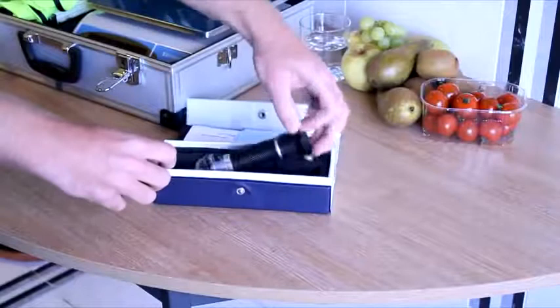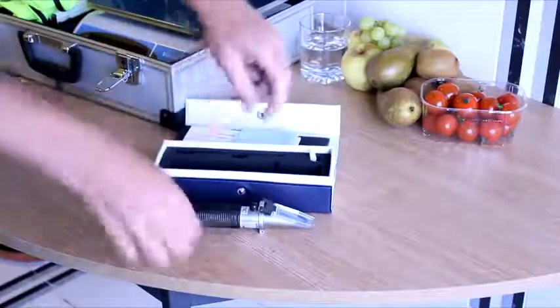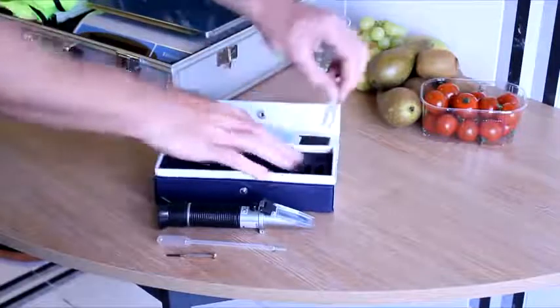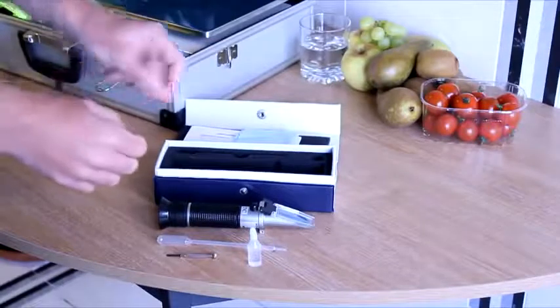So let's take a look at what we have in the box itself. First off, we have the refractometer. There is also a small pipette for transferring samples, a small screwdriver, and a bottle which in this case contains distilled water.